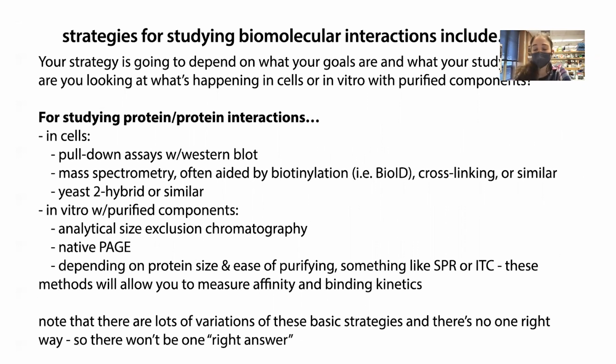A lot of them you can use for protein and nucleic acid, or for protein and different types of molecules. Some of these require labeling, some of them don't. So we talked before about SPR. I've tried SPR once. I was trying with RNA sticking to the chip, and I was having problems with the protein getting stuck on there. Tried a lot of optimizing, but never got it really to work out, and then just moved on because I had other techniques that would work.